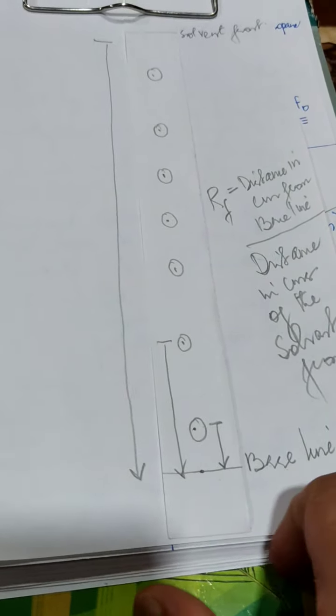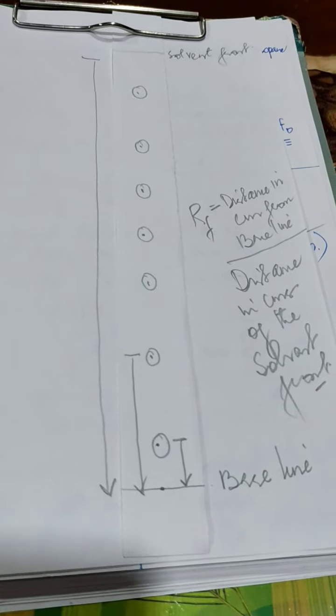This is the chromatogram, and this is the experiment that concludes here about chromatography. So hope you have understood this.